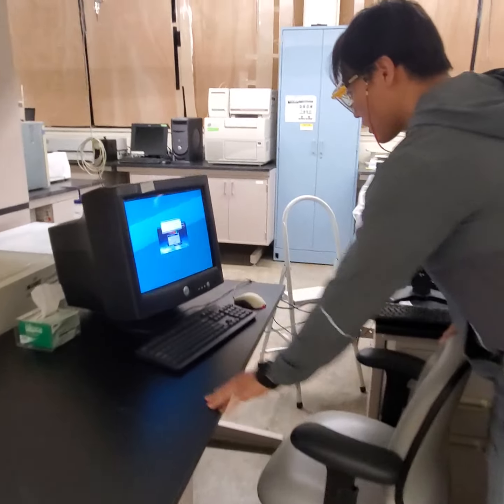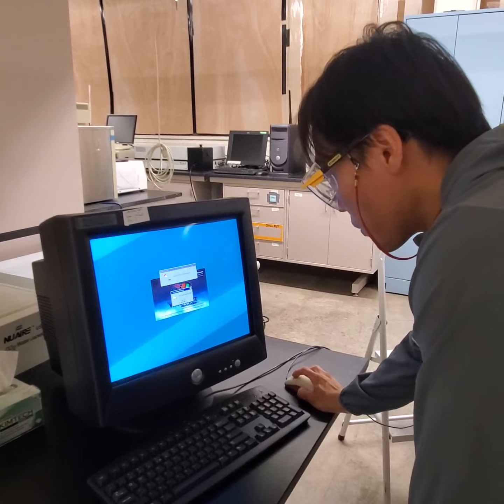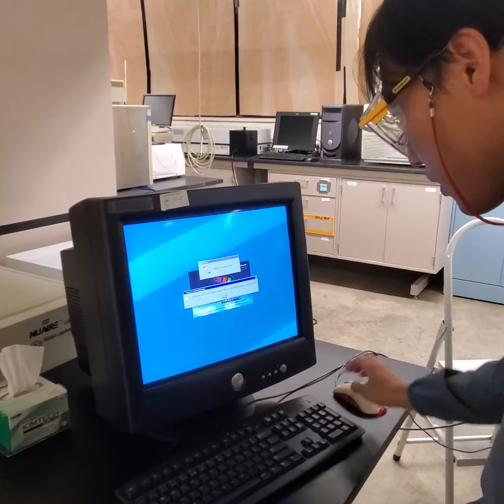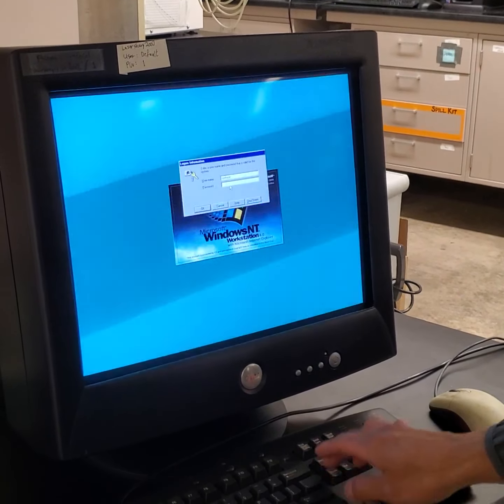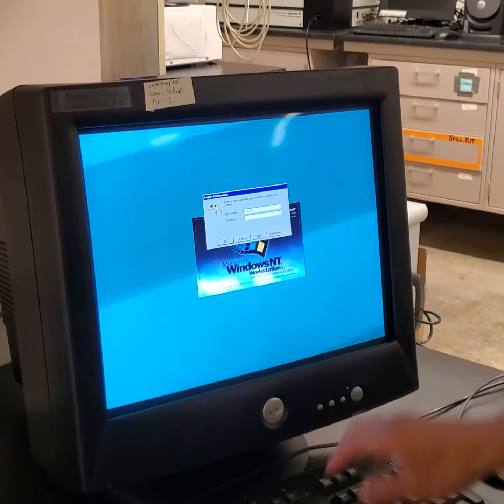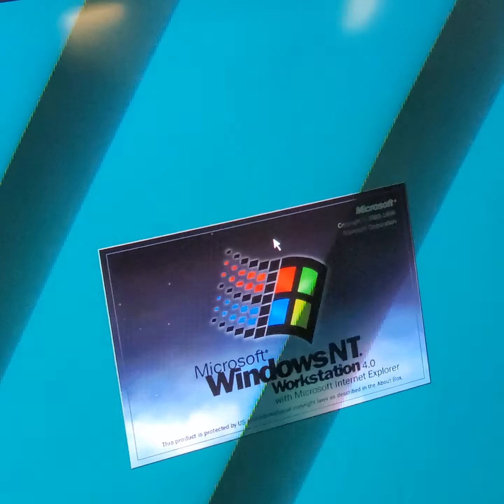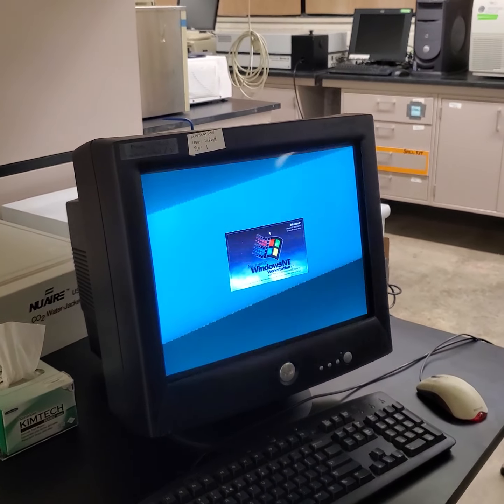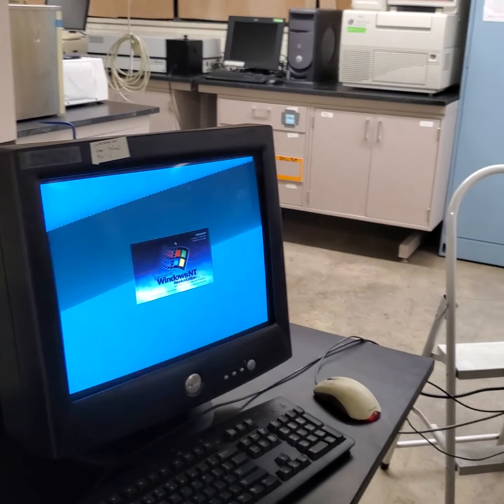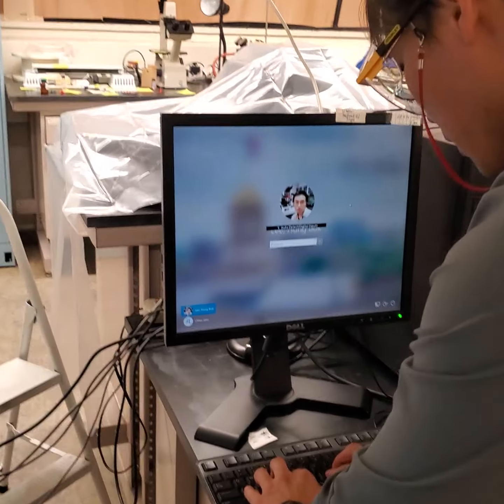Okay, so that is the screen. When you turn this on, you can ignore this logo file, and this one as well. Press Ctrl Alt Delete. The username is confocal, and the password is the same, confocal. And this one is for the linear motorized system. You can log in with your Hawk ID.